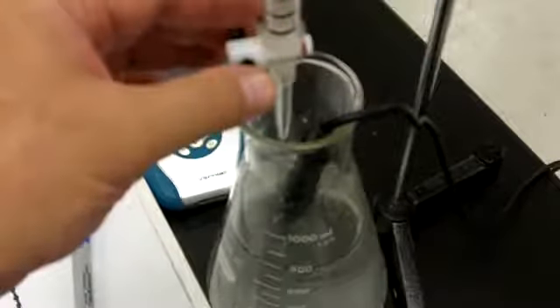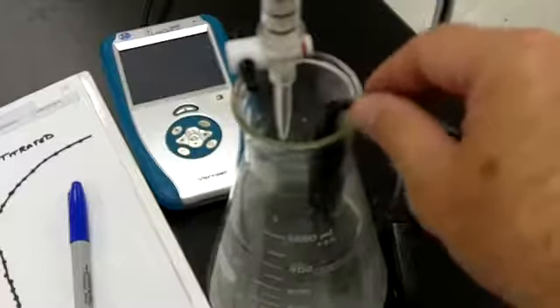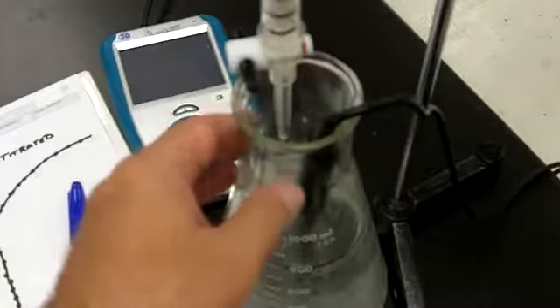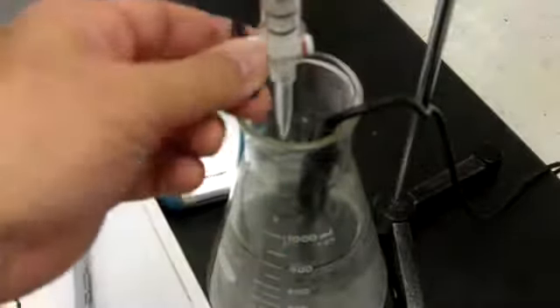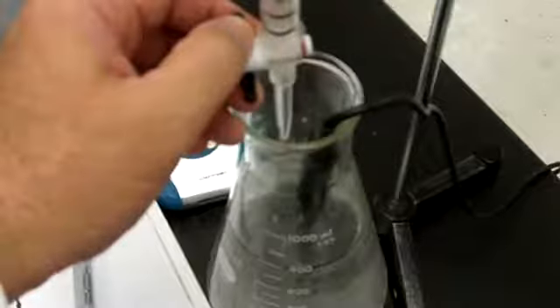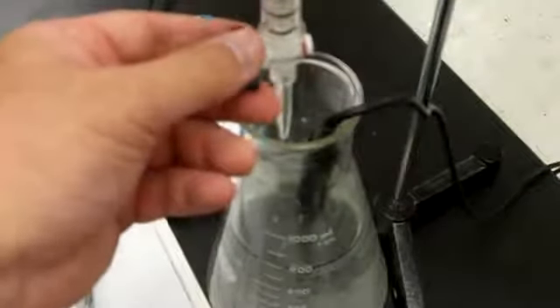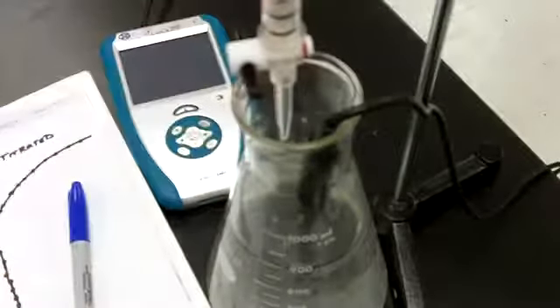and I carefully determined the pH using a pH sensor connected to a LabQuest. So this is the pH sensor that I used, and what I did was, first of all, determine the original pH of the hydrochloric acid, and I'll give you that data in just a minute. But I took the original data, and then what I did was slowly I opened up the stopcock and I released 1 milliliter of sodium hydroxide into the Erlenmeyer flask, and then closed it back up again, determined the pH, recorded that value, and then did that again many times until I created a titration curve.